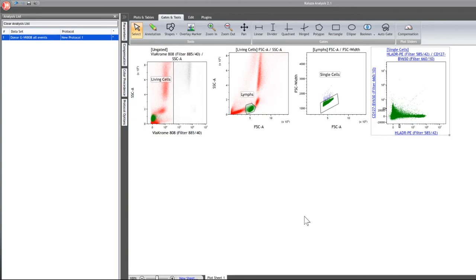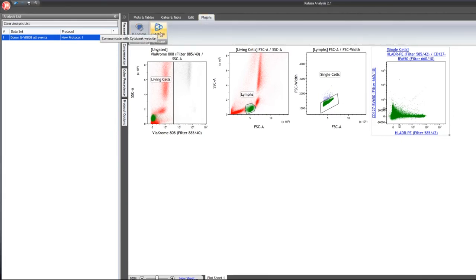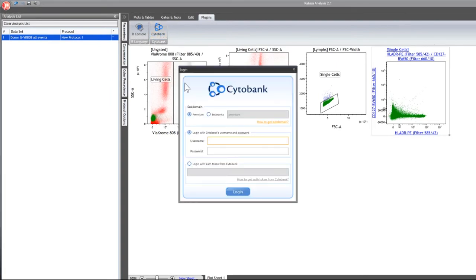Once the data is properly scaled, gated, and compensated, use the Clusa Cytobank plugin to send the data from your local resource up into the Cytobank cloud. Go to the plugins tab and select the Cytobank plugin. If you need help installing it, instructions are available on the website. Within the login screen, select your subdomain if you are on a premium or enterprise server, then log in with your Cytobank username and password.